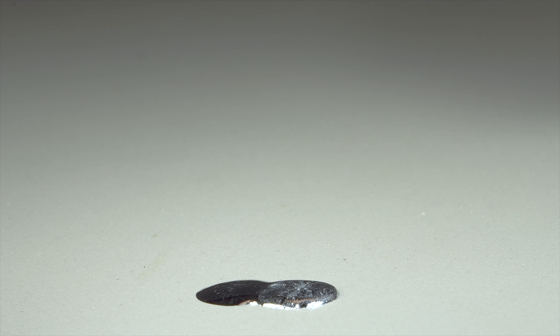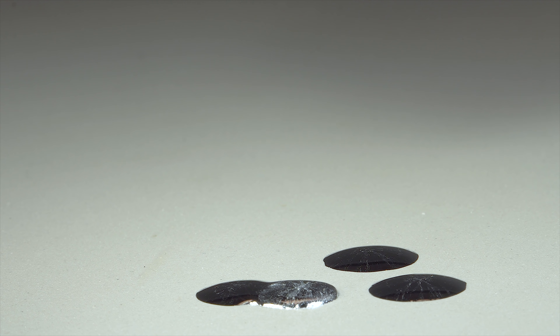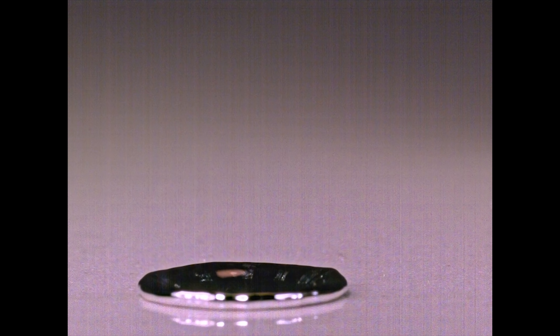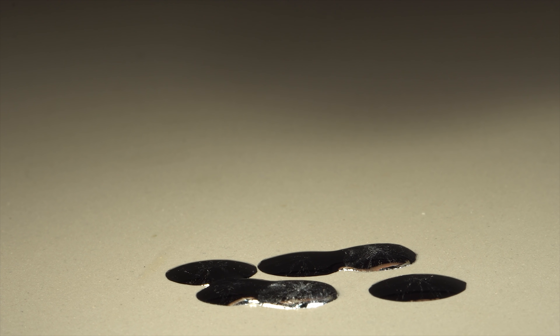However, if hot gallium is dripped onto a regular solid surface, there is no consolidation occurring, and the drop stays liquid for a pretty long time. If gallium isn't that hot, it may form a little pyramid, as the surface tension depends on the temperature, and in this case it doesn't let the drop smear. Take a look at this process in slow motion.